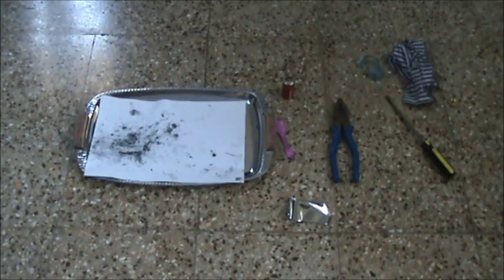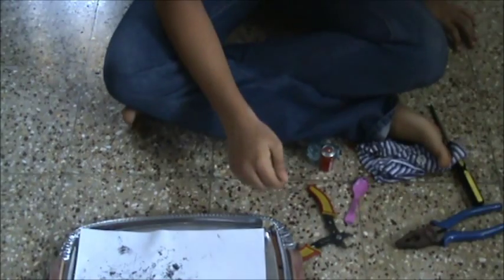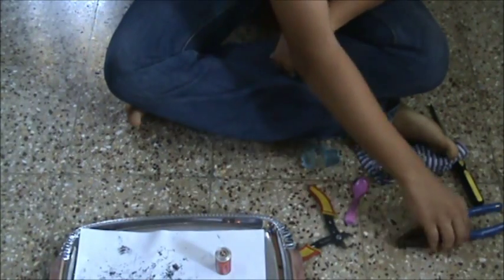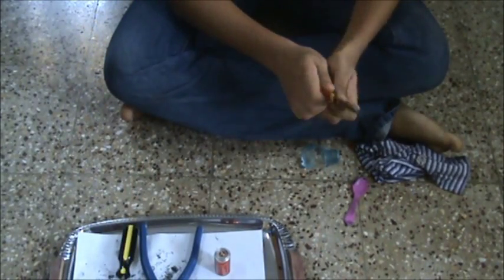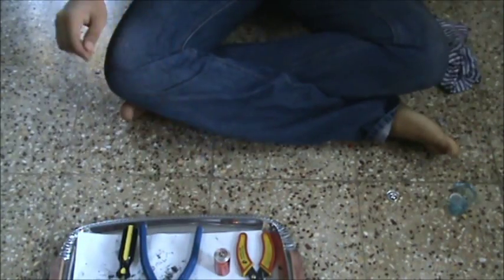Today we'll be opening up a battery to extract the chemicals inside. There are three main things: the zinc metal, the carbon rod, and the manganese dioxide powder. To perform this experiment, we will require a C-size Ever-Ready battery, pliers, a screwdriver, a wire cutter, and a plastic spoon.